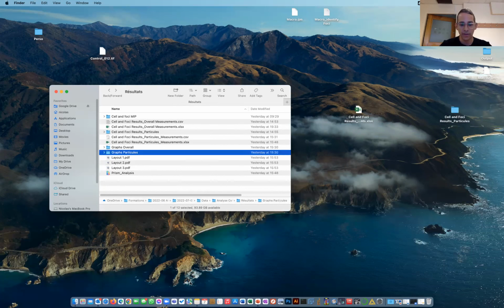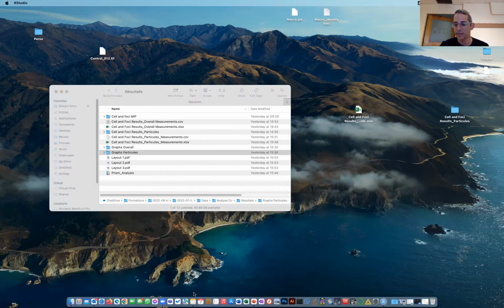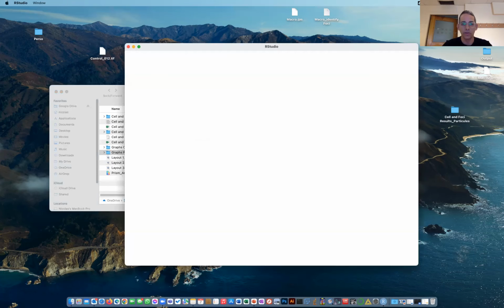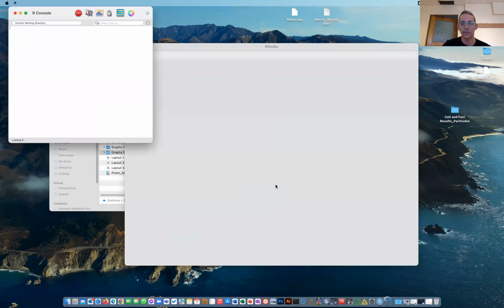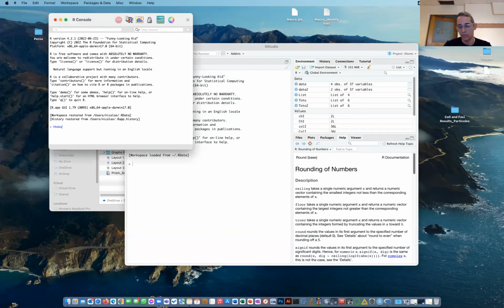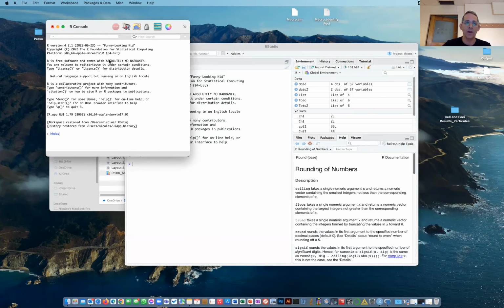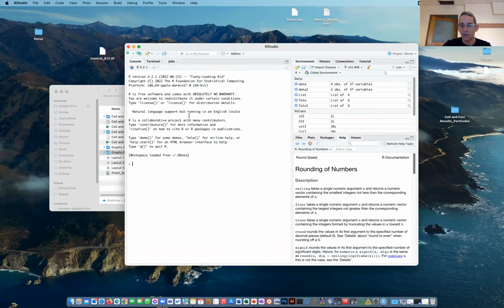I'm going to use something we call R. R is a statistics and programming language. You can use it using the raw interface of R, which looks like that, or you can use RStudio, which is a more user-friendly interface. This is R, and you can write something and it will do things as you write them. But the console is very limited and doesn't have a lot of options. So there is another software that uses R below, but gives you a nice view and a nice environment to work with.